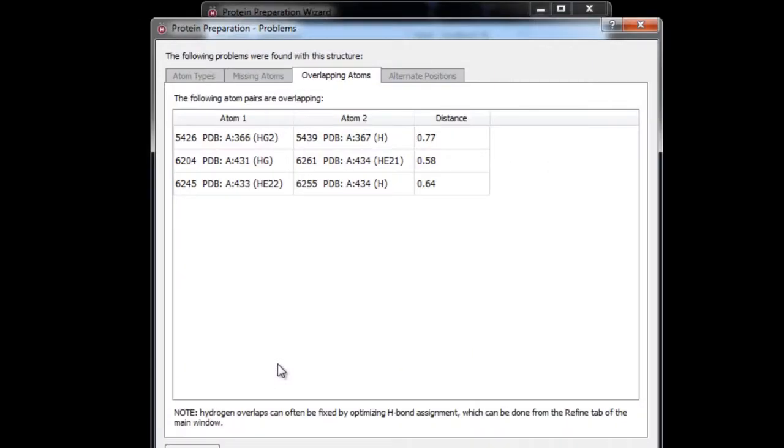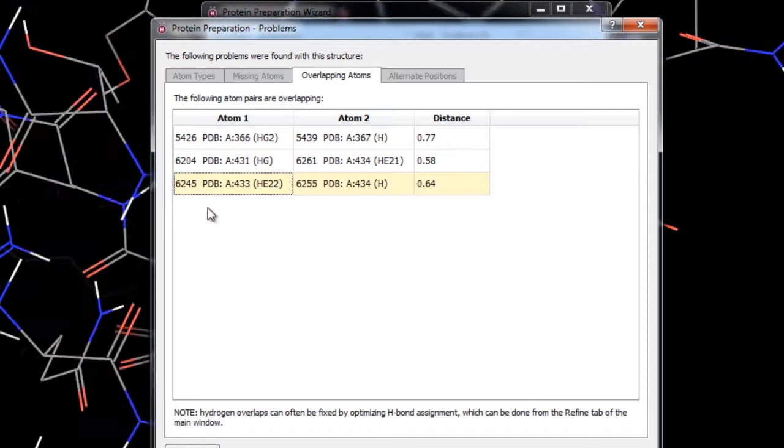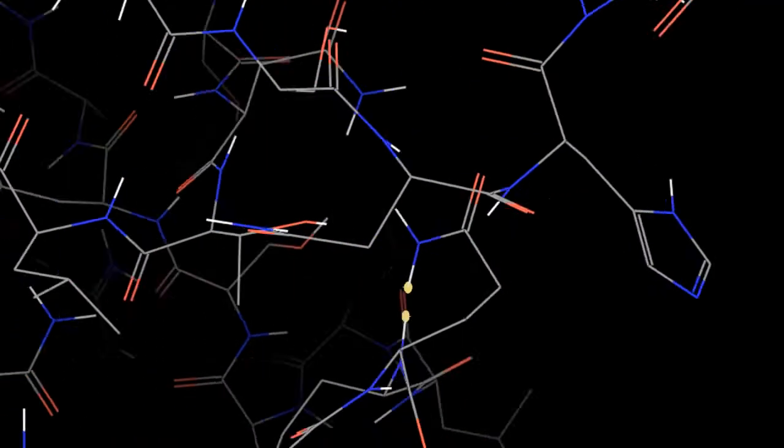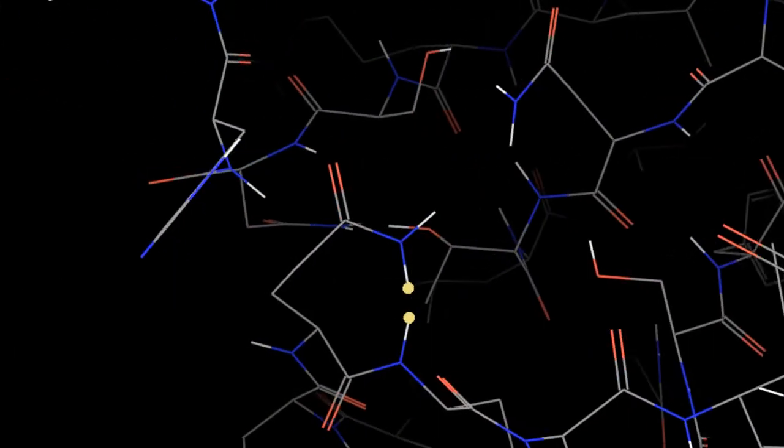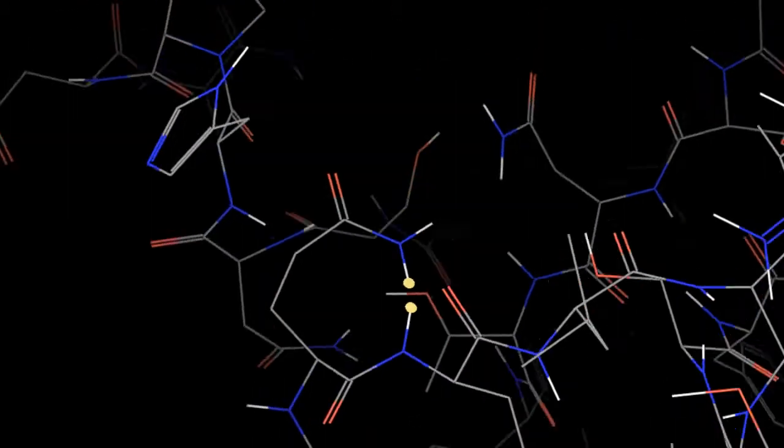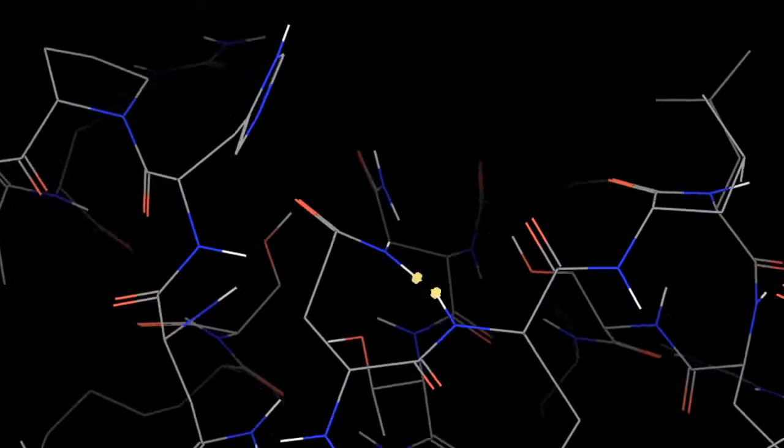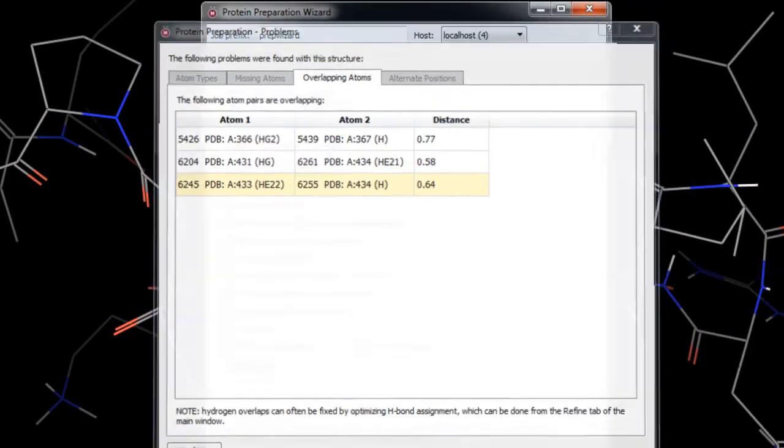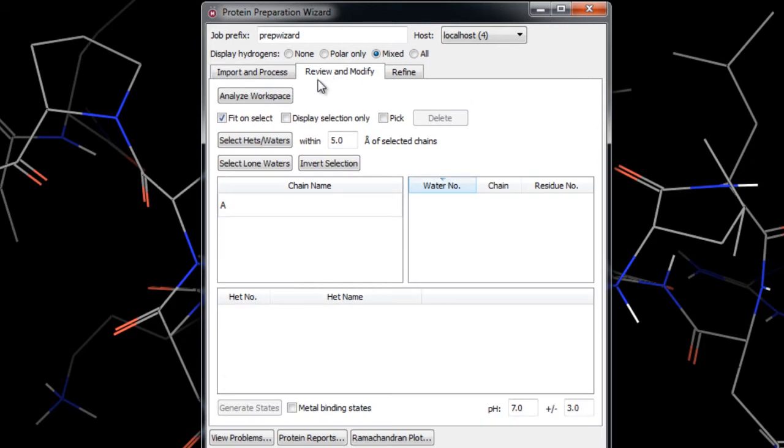We won't worry about any overlapping atoms at this point as they should get fixed later in refinement. For example, this clash looks like the glutamine needs to be flipped and that should be corrected later during H-Bond optimization. Under review and modify we'll click the analyze workspace button and in this case there are no hetero groups to generate states for so we'll just continue on to the refine tab.